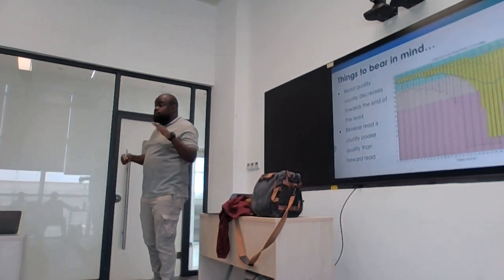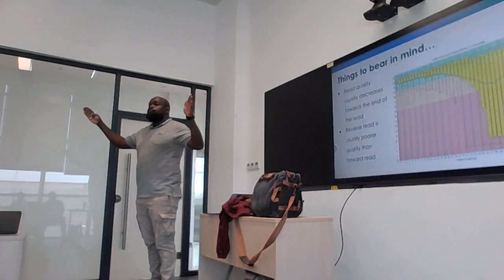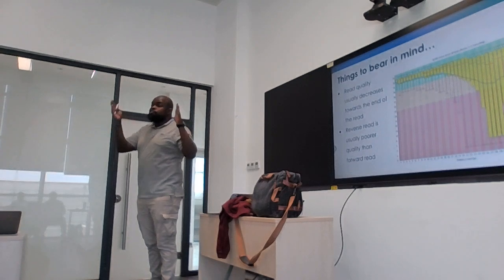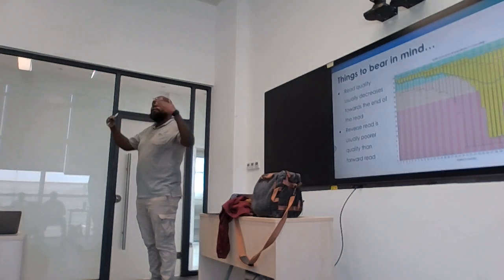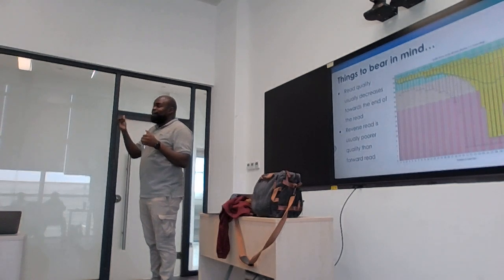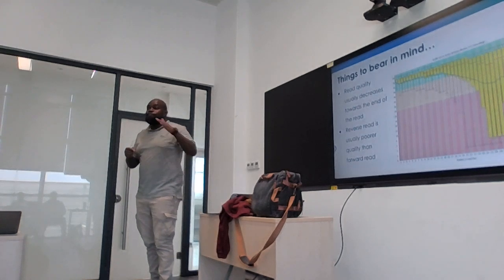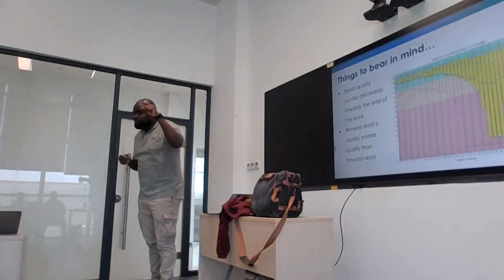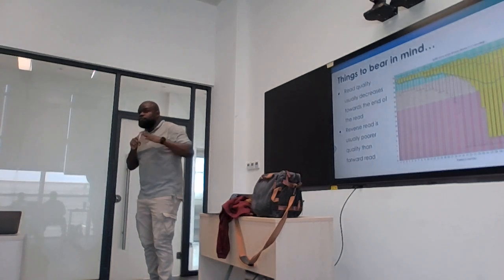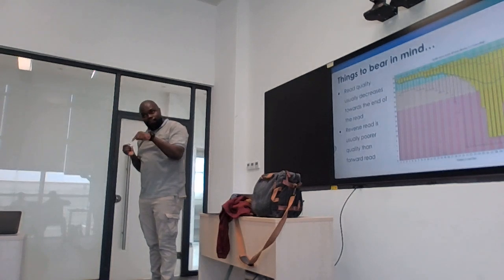Remember that both forward and reverse cover the whole genome. So, deciding between 80-20 and 60-40, you have to ask yourself, why do we do paired end sequences? It's because we always want our assembly to be as accurate as possible. You want to be sure that if the forward reads are calling a position A, the reverse reads are also calling that position A, right?